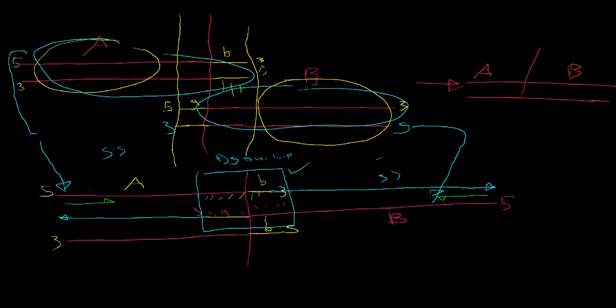So this forward oligo can bind to anything on A, and on the big A, it will bind to the product. It will bind to the reverse complement fragment of the original A, and our reverse oligo will bind to the forward product of our B fragment.